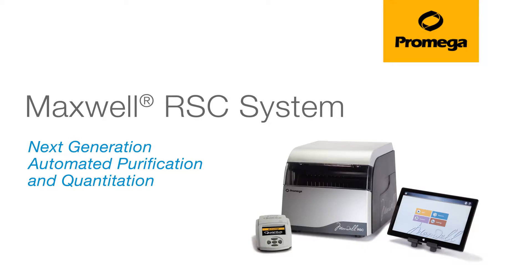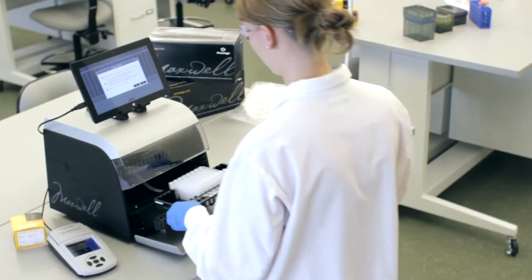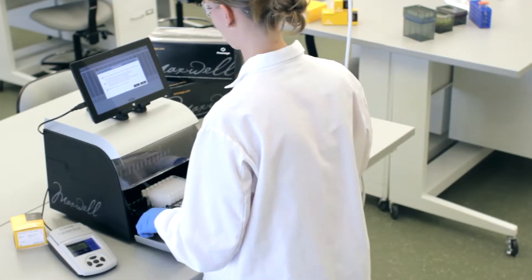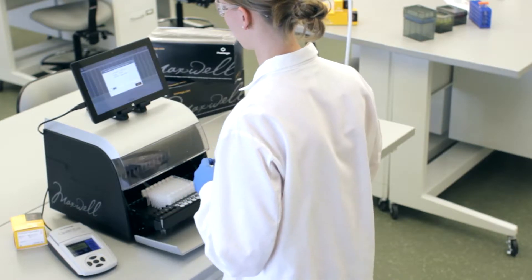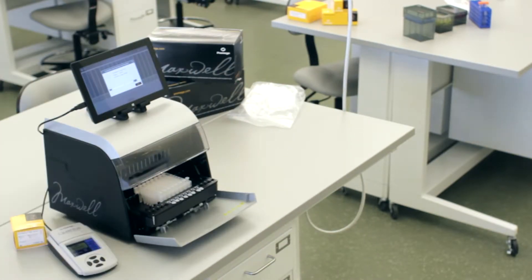The Maxwell RSC system is your personal purification assistant. It easily integrates into any laboratory workflow, and its compact size minimizes the impact on precious laboratory space.